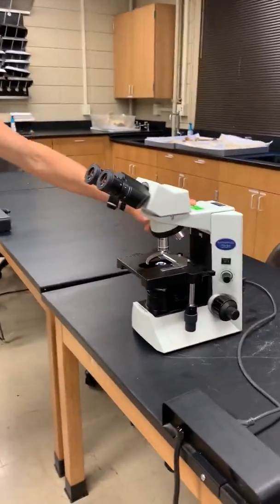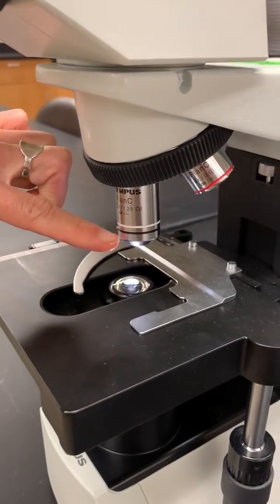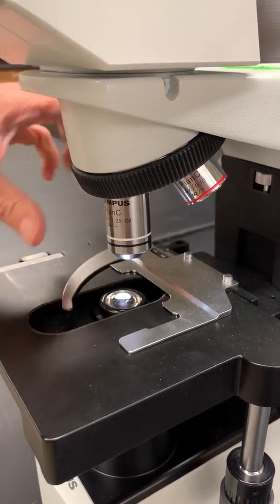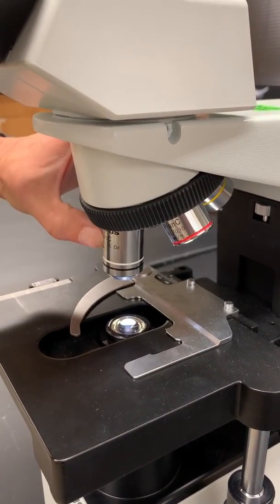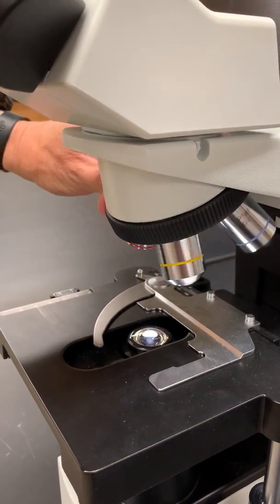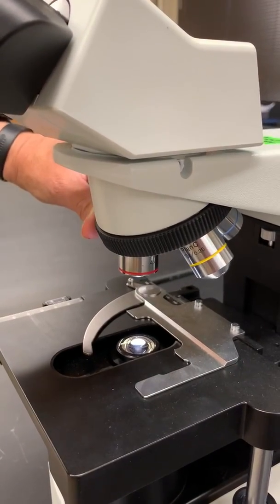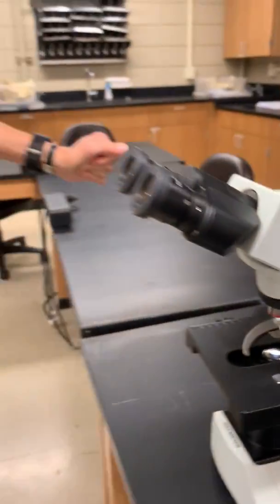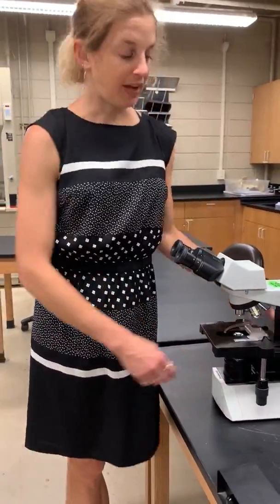One thing about these objectives — the one with the black and white, we're going to stay away from that one because it requires oil. Whatever you do, don't let that one grind against the slide because it'll scratch it up if we're not using oil. So we're really just going to focus on the red, the yellow, and the blue — those are our main objectives. If you guys get stuck or have any questions, definitely send me an email and we'll get it sorted out.